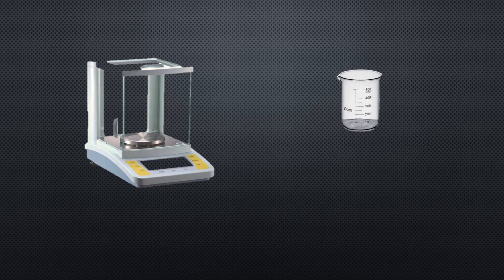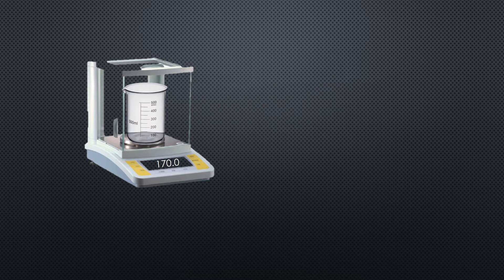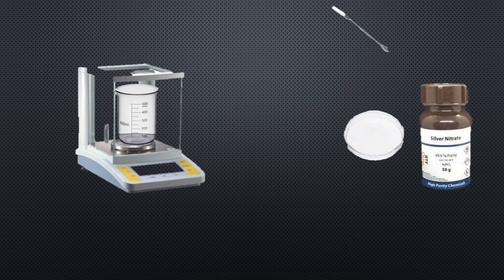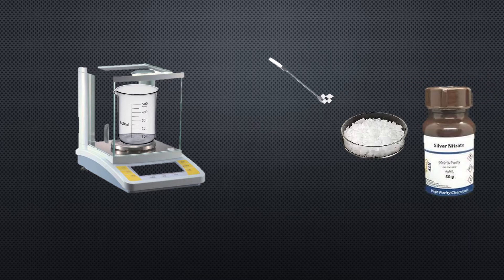First of all, turn the weight balance on. Now place the empty beaker on the weight balance — the weight balance displays its weight. Now press the tare button. You can see that the weight balance shows the weight of the beaker as zero. Take 1.6987 grams of silver nitrate in the beaker with the help of the specula.